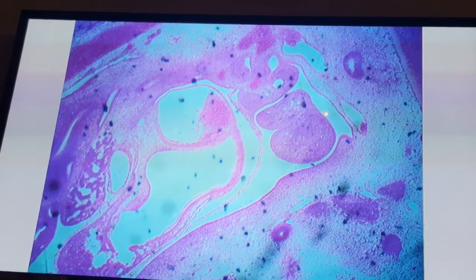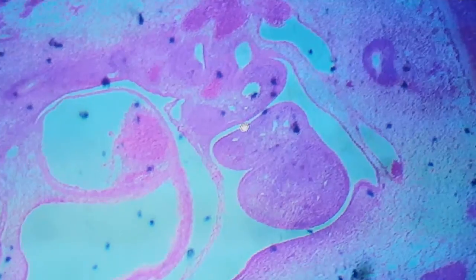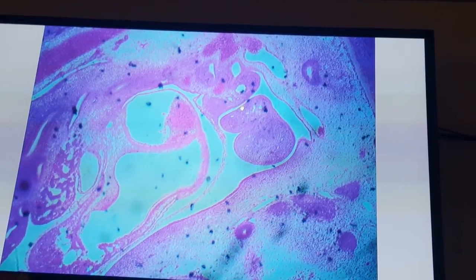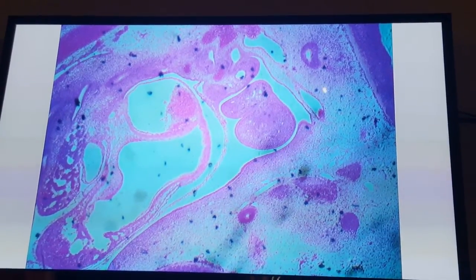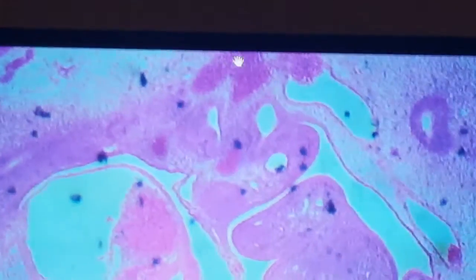That is the pharynx, and you can see how the pharynx shows extension from the lumen, which is the pharyngeal pouch, but in sagittal section. And this is extension from the ectoderm, which is the cleft, but in sagittal section. Also, the section shows the ear vesicle, and this is the ganglia of the 9th and 10th, or the ganglia of the 10th cranial nerve, and of the 5th cranial nerve, which is the trigeminal ganglia, but also in sagittal section, not in a transverse section.